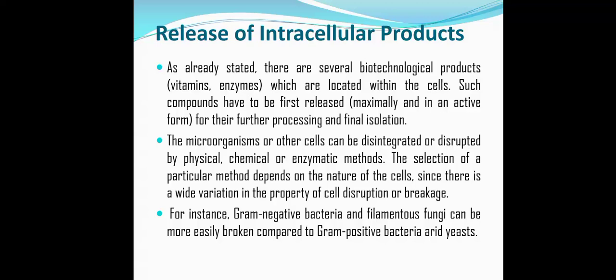Now, the steps within downstream processing are similar for both intracellular and extracellular products. One difference is that in the case of an intracellular product, an essential extra step within the downstream processing is the release of the intracellular product. This initial extra step is involved in the extraction and purification of these intracellular products.